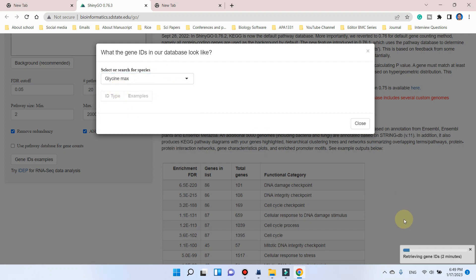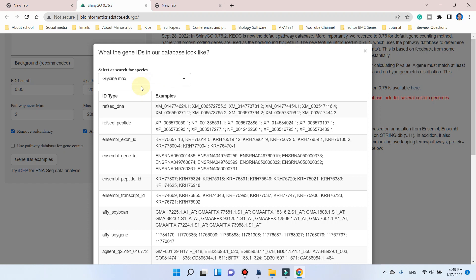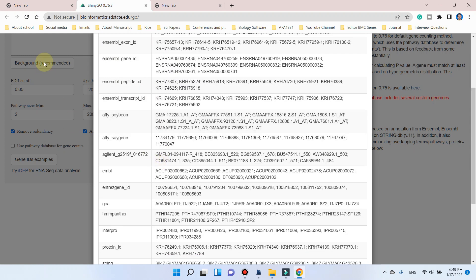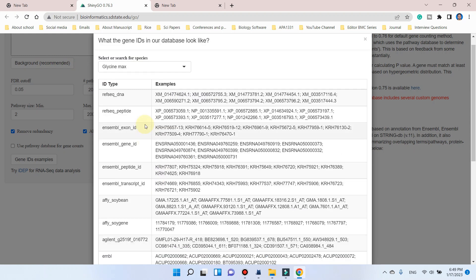When you click on this, it will retrieve your gene IDs. You can see here, here are ID types and examples which are all acceptable for this tool.